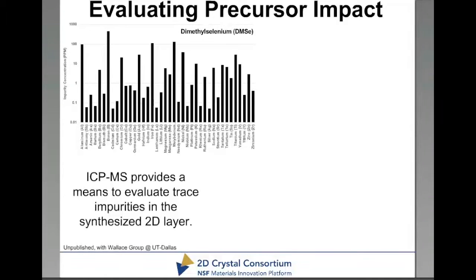So you have to think about, again, more sophisticated, more advanced ways to really identify what is going on in your material, because we know we're at least depositing carbon, but what else are we depositing? So in this particular case, one technique is inductively coupled plasma mass spectroscopy. This is actually laser ablation, the way this schematic is shown here.